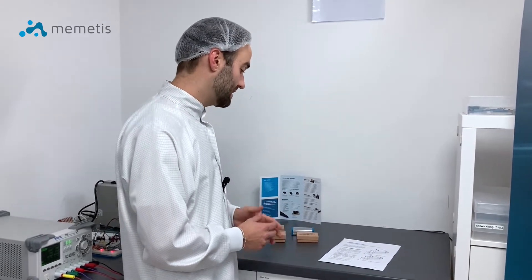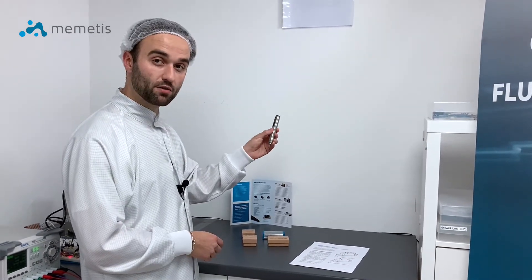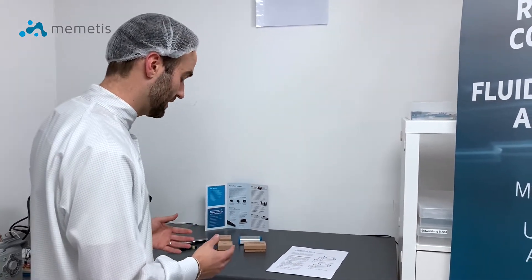In order to set up the evaluation kit you will need tweezers, a screwdriver and a power source with a mini USB cable. I will now show you how to set up the evaluation kit.